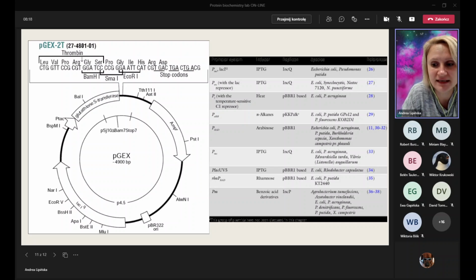It's the idea of the beads. So we are using affinity chromatography, and we are using an enzyme and its ligand. What we know about enzymes is that usually they have to have some kind of a conformation to recognize the ligand. So if we want GST to recognize glutathione, we have to have it in the right conformation. That's why we cannot denature this protein. It will not bind GST resin.